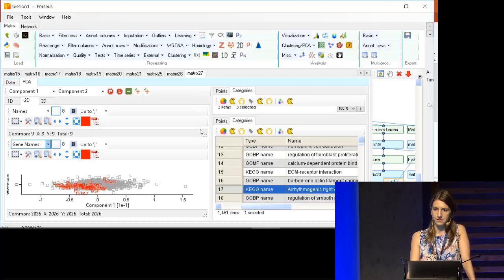Hello. I always do label-free quantification, and I always apply normalization in MaxQuant. But as I said yesterday, I can still see some batch effects despite the normalization. I wonder, is it okay to perform a second step of normalization in Perseus?